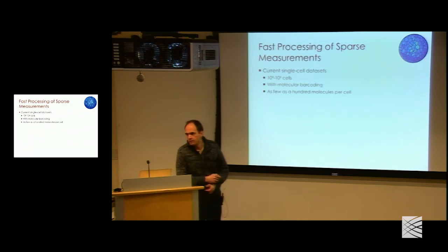Can you please unpack that? Molecular barcoding. What is that? Okay. So this is going back to Allon Klein's protocol slide. I wanted to explain it there, but essentially the idea is that during generation of cDNA, and different protocols do this in different ways, you incorporate two barcodes. One marks the cell that this came from, so let's say the droplet. Most likely this barcode will be unique for the droplet. But then it also has a little random sequence next to it, let's say 6, 10, or 20 nucleotides that are synthesized to be random.